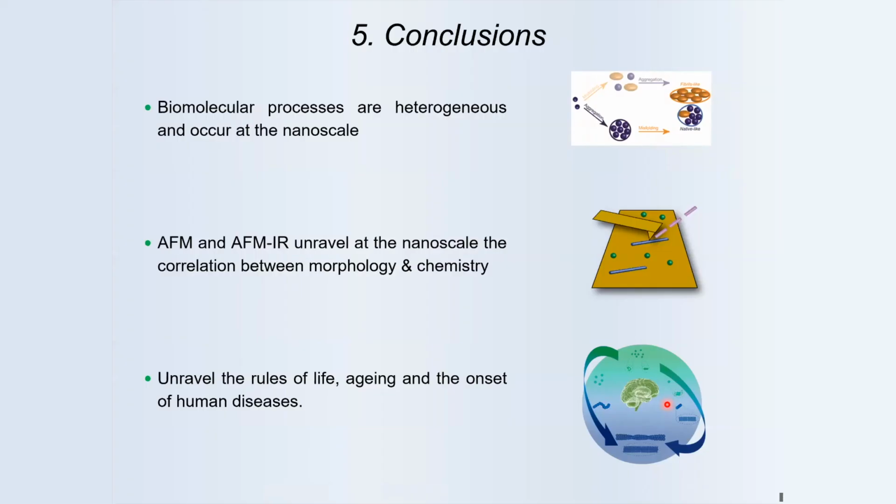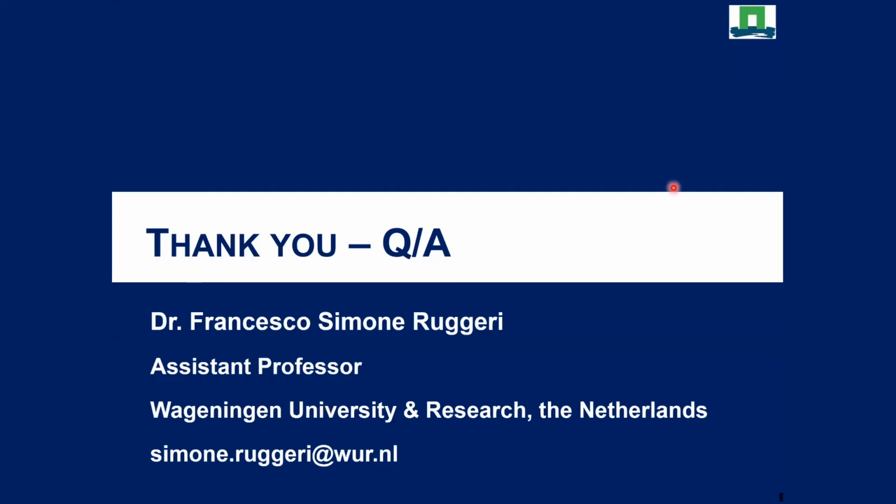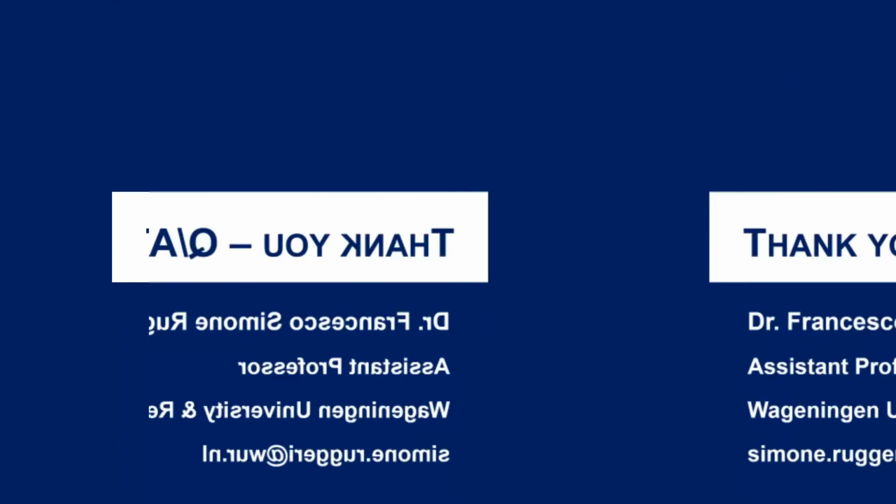And with this, I would like to thank you for your attention. I hope I showed you how, in order to study biomolecular processes which are very heterogeneous at the nanoscale, it's very useful to apply atomic force microscopy, but also combine methods to arrive at chemical properties. And I hope I showed you how this can be useful to unravel the rules of life, understanding the concept of neurodegenerative disorders, and also maybe in the future to produce functional biomaterials. And with this, I'm done, and thank you very much for your attention.